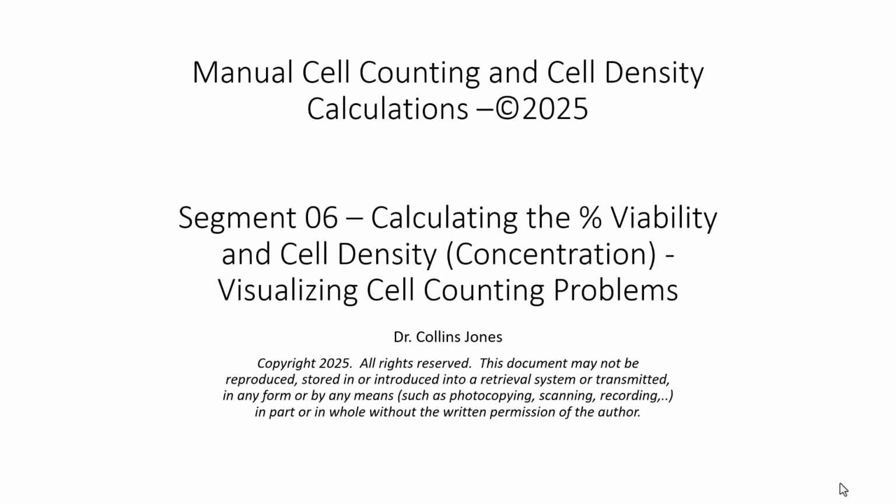In this segment, we're going to do some additional practice problems, but the focus here is on visualizing what's happening. That is, matching the word problem to what you're actually doing in the lab. So to do that, I've created some pictures. They're not the greatest, but hopefully they'll give you the idea to illustrate the actual process associated with the words in the problem.